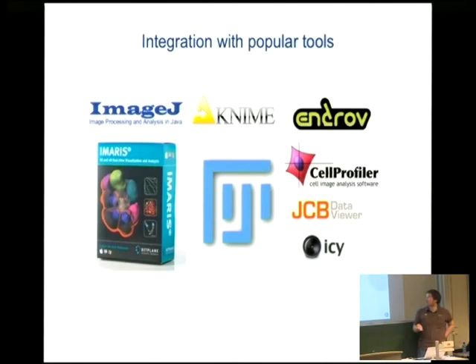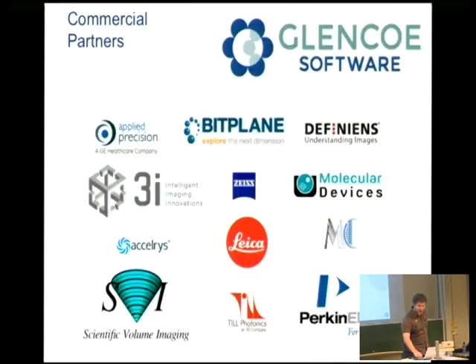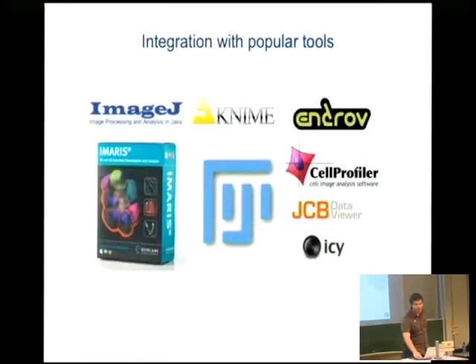So there are tons and tons of tools in image analysis, for various tasks to do with images and other microscopy measurements. Up until this point, a lot of them would only work with some image formats. But as time goes on, and we can import more image formats into OME XML, if the projects then pick up OME XML as one of their supported formats, then you get a big win there for free. So you start to be able to use the best tool for the job, rather than being dictated to by whatever image format you happen to have.